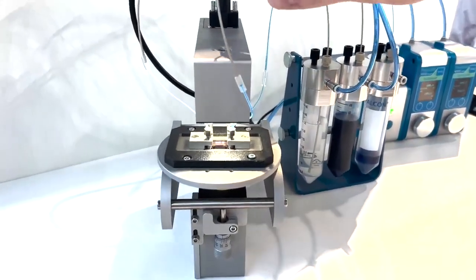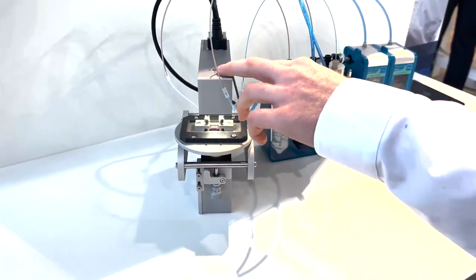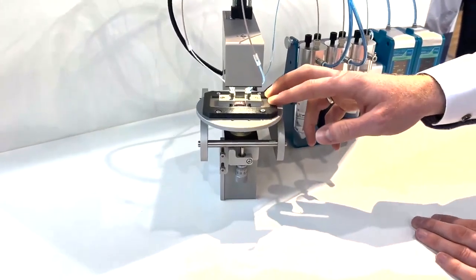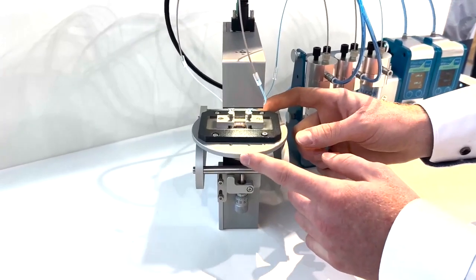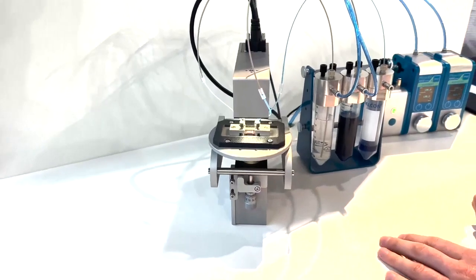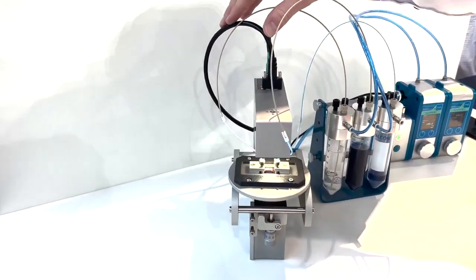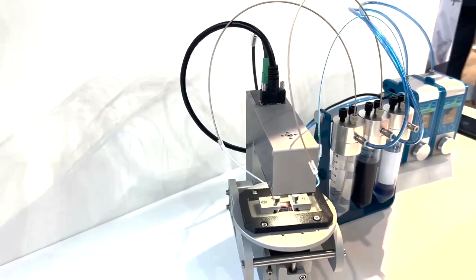This is a fully functional inverted microscope consisting of a continuous white light source and an integrated microfluidic chip device. The chip is mounted on an XY stage to move it laterally. Additionally, there is a possibility to adjust the Z focus precisely. Underneath the stage, a long-distance microscope objective is integrated. An Ethernet port is used as a data transfer interface.